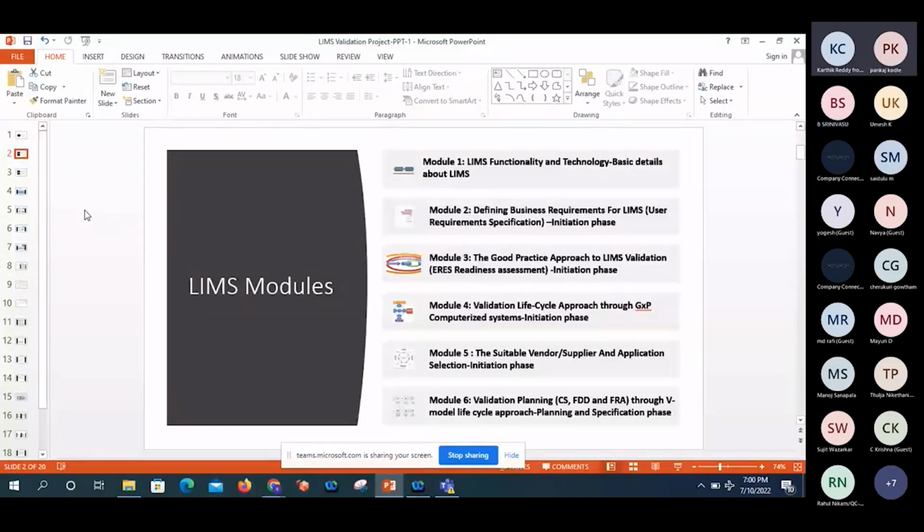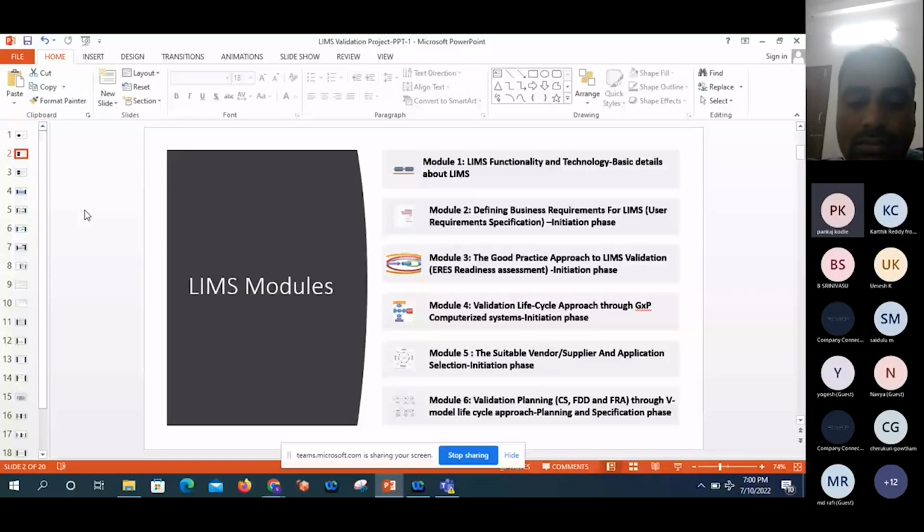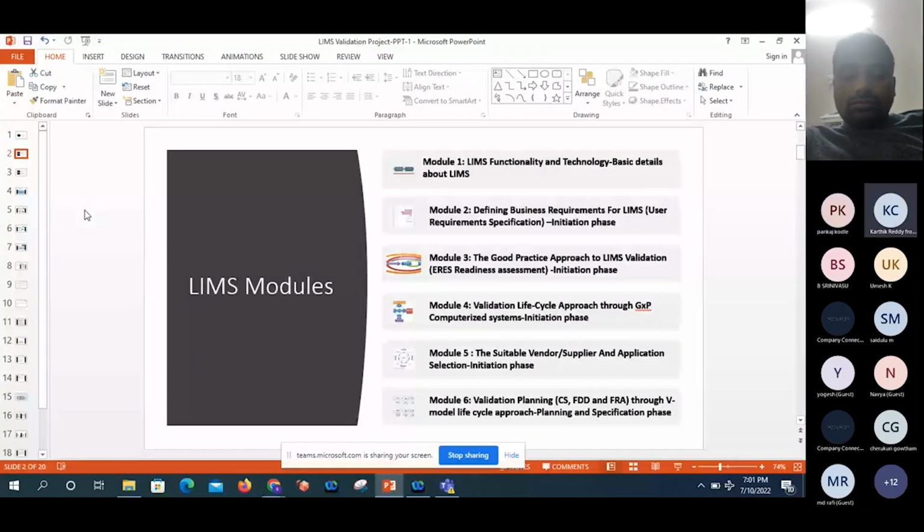Through defect management, we will maintain any issue that was happening. My question is that we will test the complete module of that stability module. The first module is the lot module, implemented, and the second module is the inventory module. Apart from inventory module testing, is another testing required? For the second module, we will check the complete flow. But apart from that, what do we need to check in each and every module when we implement a new module?